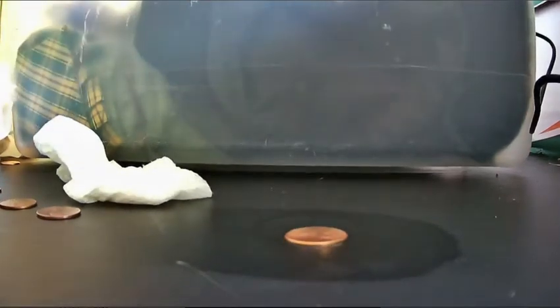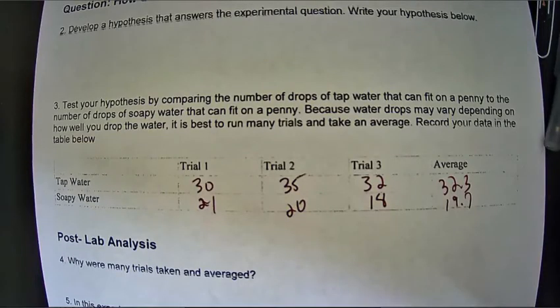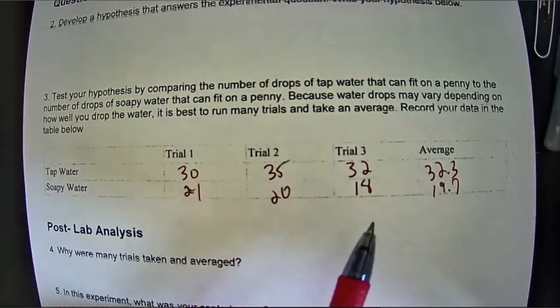Alright, it started spilling at 21, so I would write that down as 20. Now I'm going to do this one more time, and then we'll start getting some averages. Okay, I did one more trial with the soapy water, and it came out to be 18 drops.